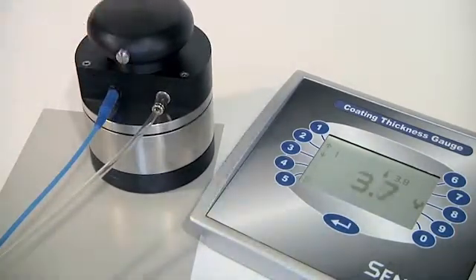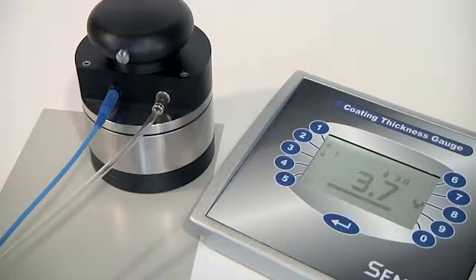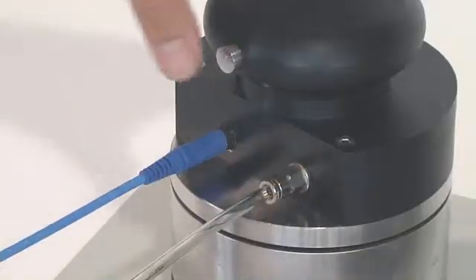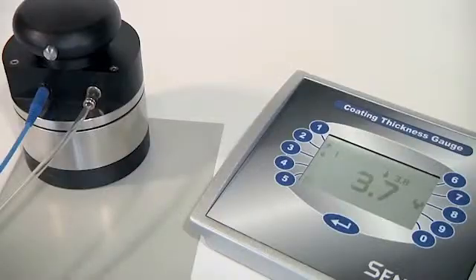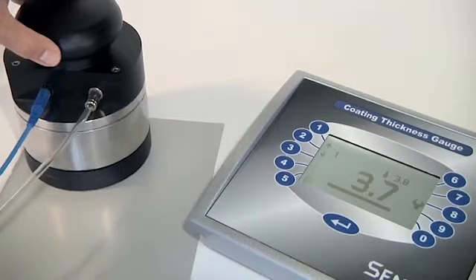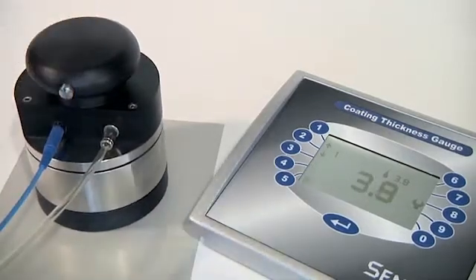The air cushion allows the probe to be moved smoothly, on and off the sheet, and to each test location. The R&R repeatability of the Sencon hover probe is better than 10%, which is a world-class standard.